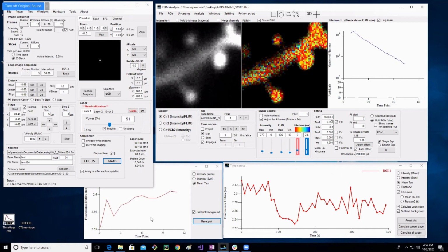However, if you attach GFP to a protein and you express it in neurons, it usually is slightly different because the environment of it is slightly different. And this is something that for a new sensor we typically would measure by just expressing the donor part of our sensor in either cell lines or neurons, taking a bunch of images and doing a single exponential fit.